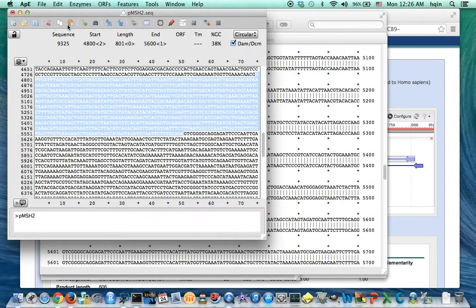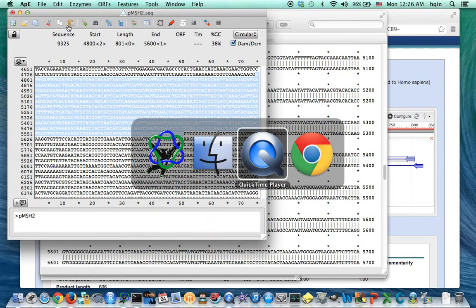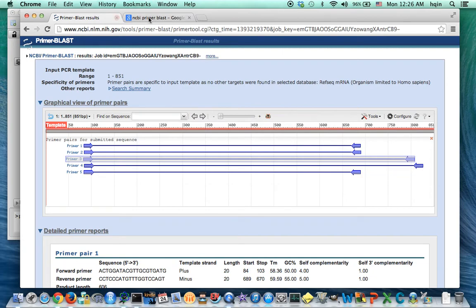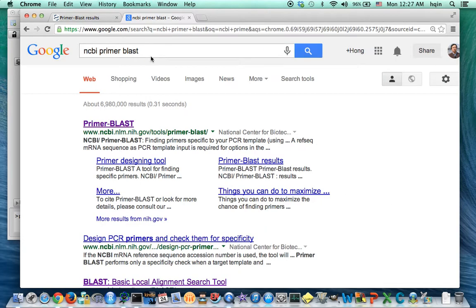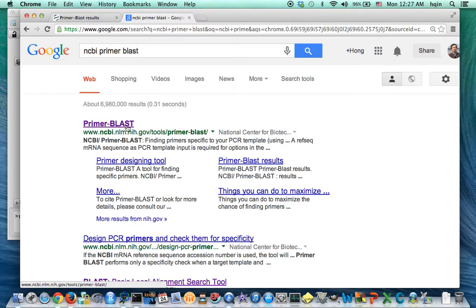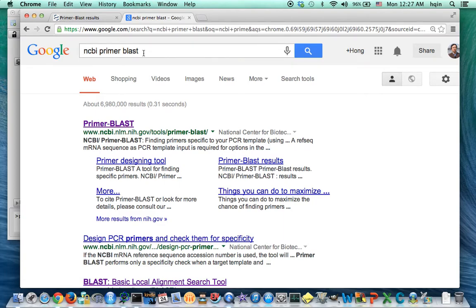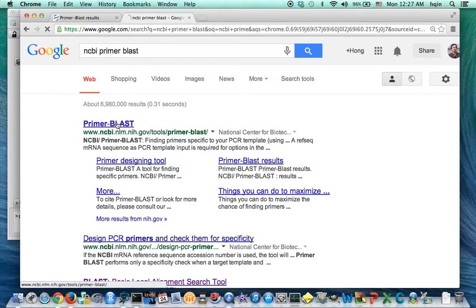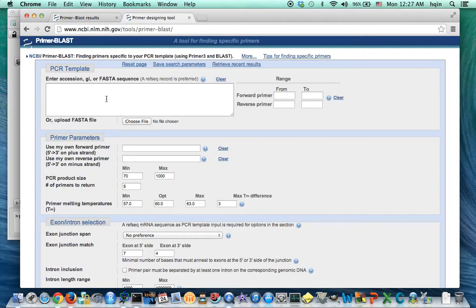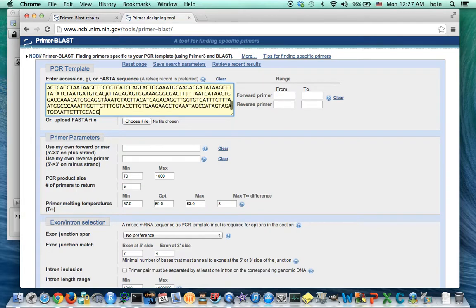Now then I go to a website called NCBI Primer Blast. So you can just Google NCBI Primer Blast, and usually that's the first hit. So once you click that, you can copy paste the sequence into it.